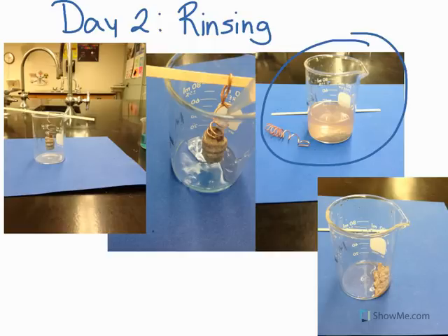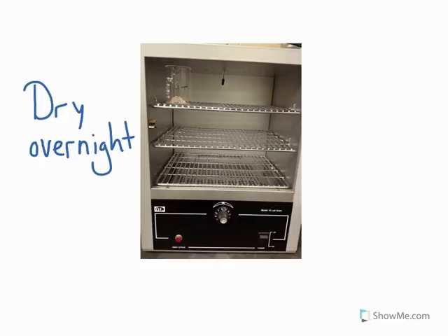Use about 10 to 15 milliliters of distilled water to do this, and then carefully decant, that means carefully pour, this top layer of liquid into the sink so that all you have left is silver metal in the bottom of your 150 milliliter beaker. Your silver product will then be dried overnight in an oven in the back storage room.